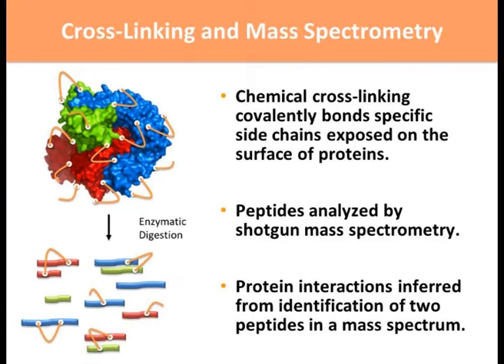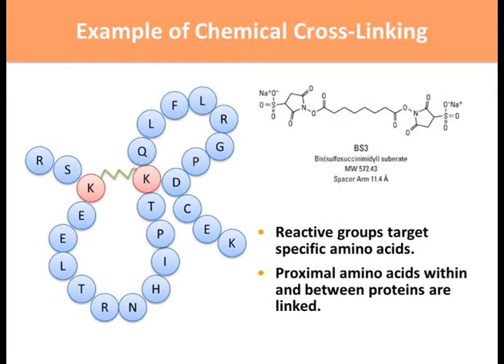proximal. The relationship between crosslinker and its efficacy, as well as its binding properties of where it can attach to the protein. There are actually many different crosslinkers available that can change the properties of the analysis. And all of that needs to be considered downstream when it comes time to analyze the data.